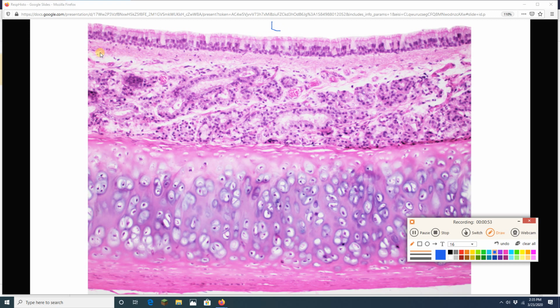And then we're going to have our mucosa of our trachea. And in our mucosa, we're going to find an epithelial lining. That epithelial lining, which I put a beautiful green arrow on, is pseudo-stratified, ciliated, columnar epithelial tissue. Pseudo-stratified meaning it is only one layer. Ciliated meaning there are cilia here. There are extensions. We'll zoom in on them in a moment, and we'll get a little more detail on an epithelium in a second.